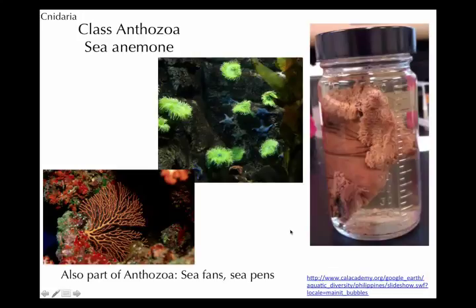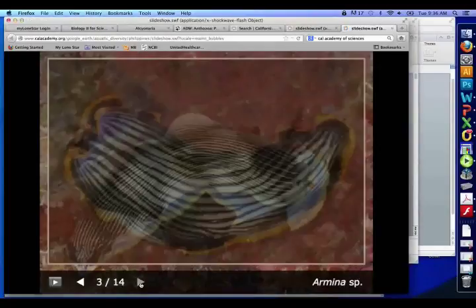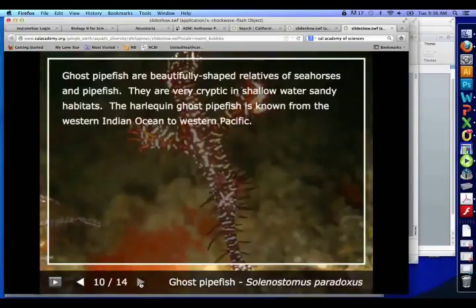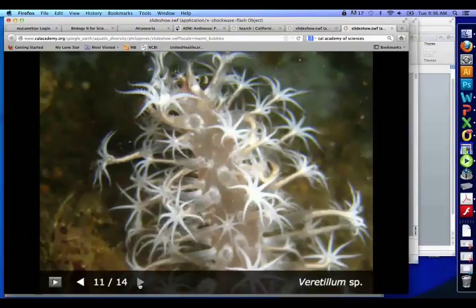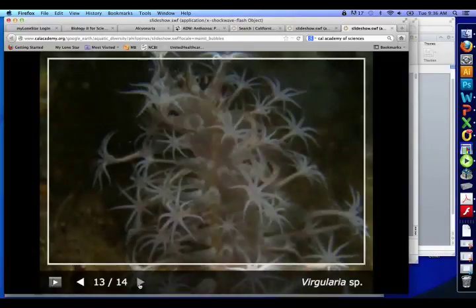So that would be good to know, at least 2 or 3 examples of organisms in the class Anthozoa. So we got the corals, the sea anemones, sea fans, sea pens, all polyp form. Oh, here, I guess I have a, so these are later sea slugs, but here are newly discovered sea pens. So that's a sea pen. That's a pretty elaborate one. This is newly discovered in the Philippines in 2011. And that's a sea pen as well, so that one looks more classic.